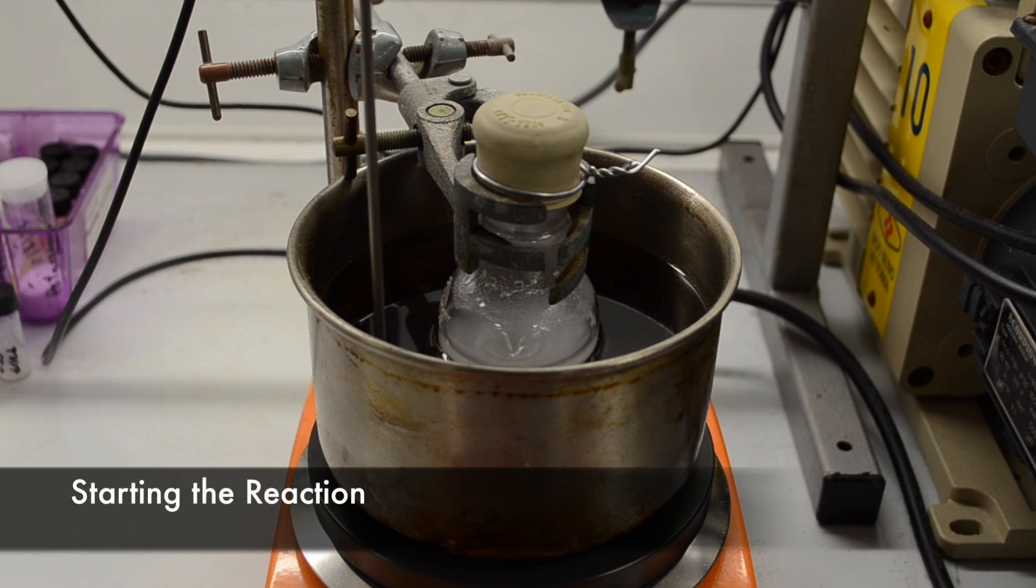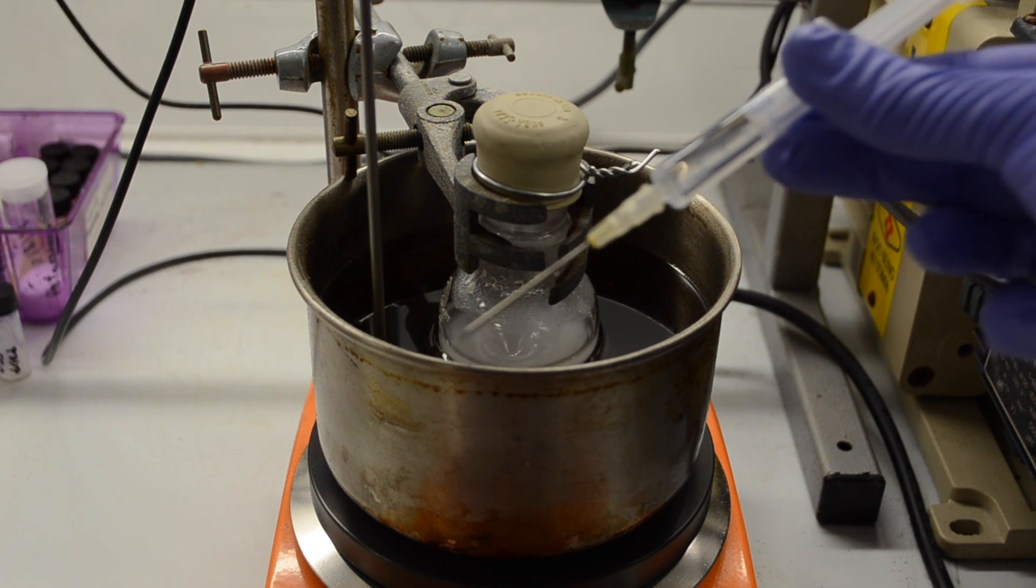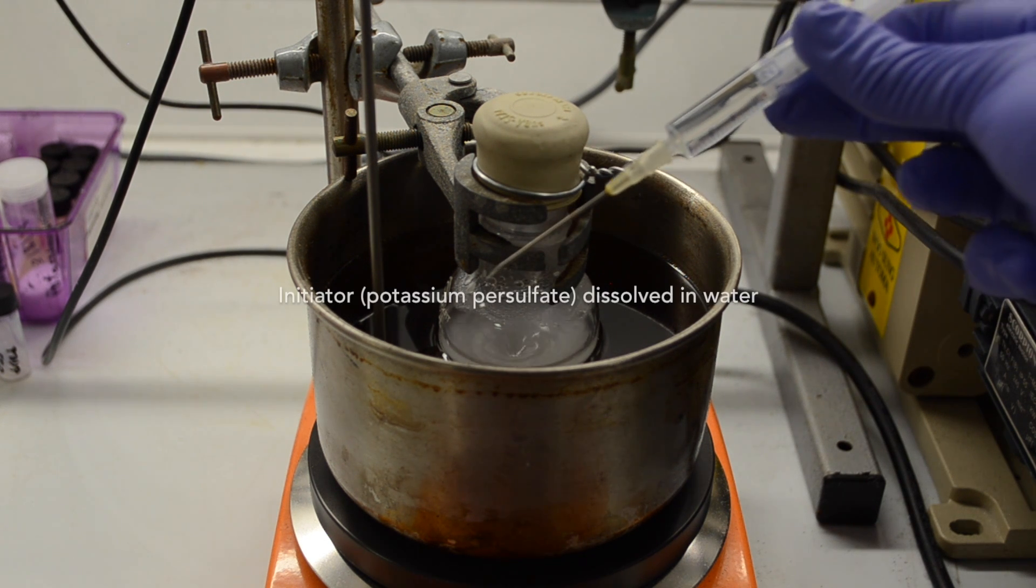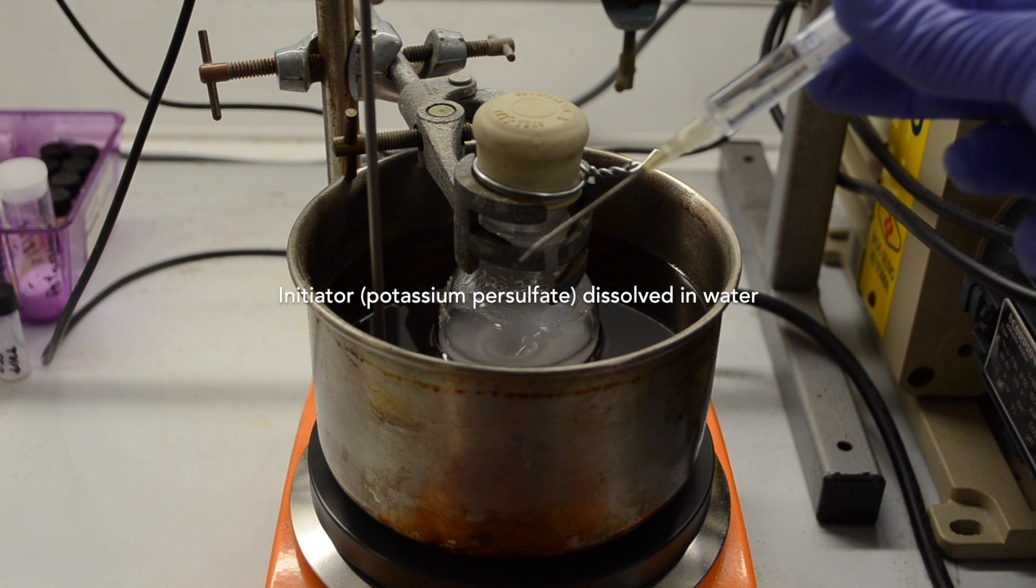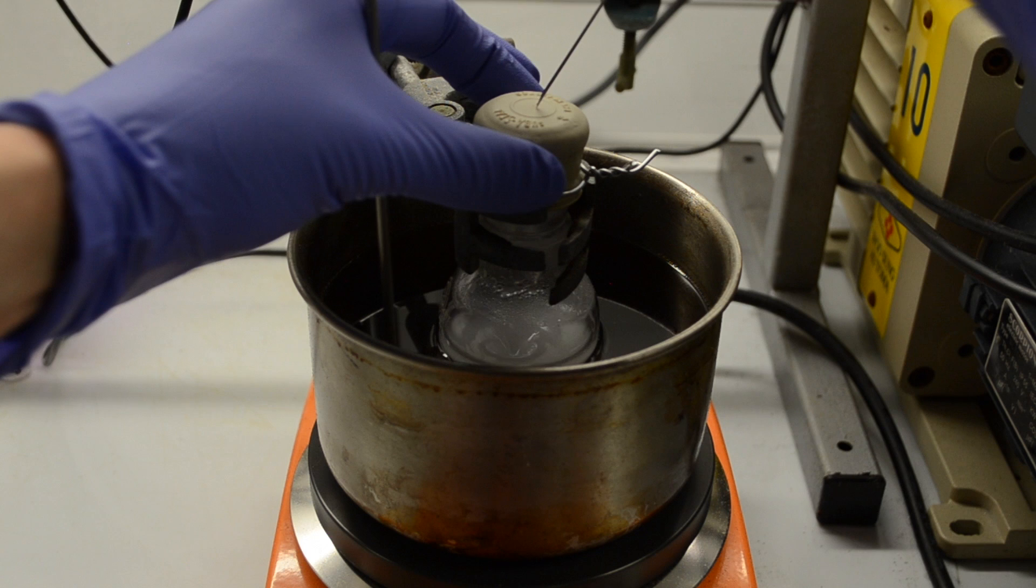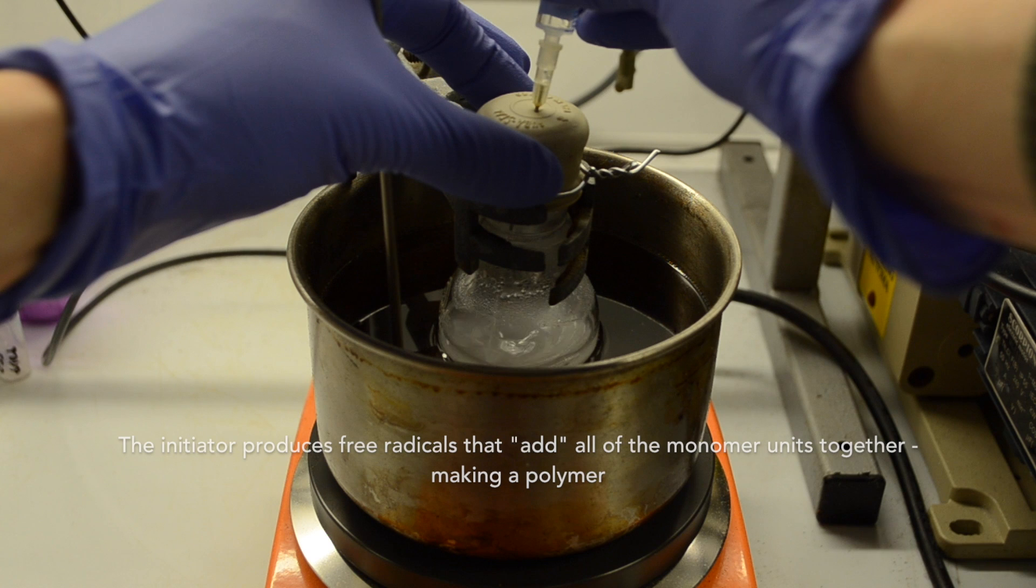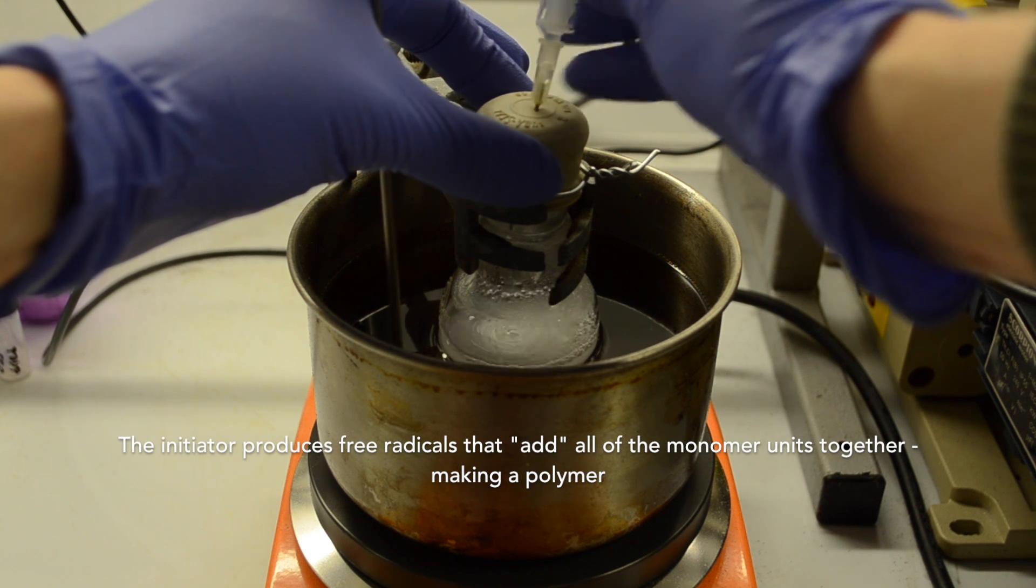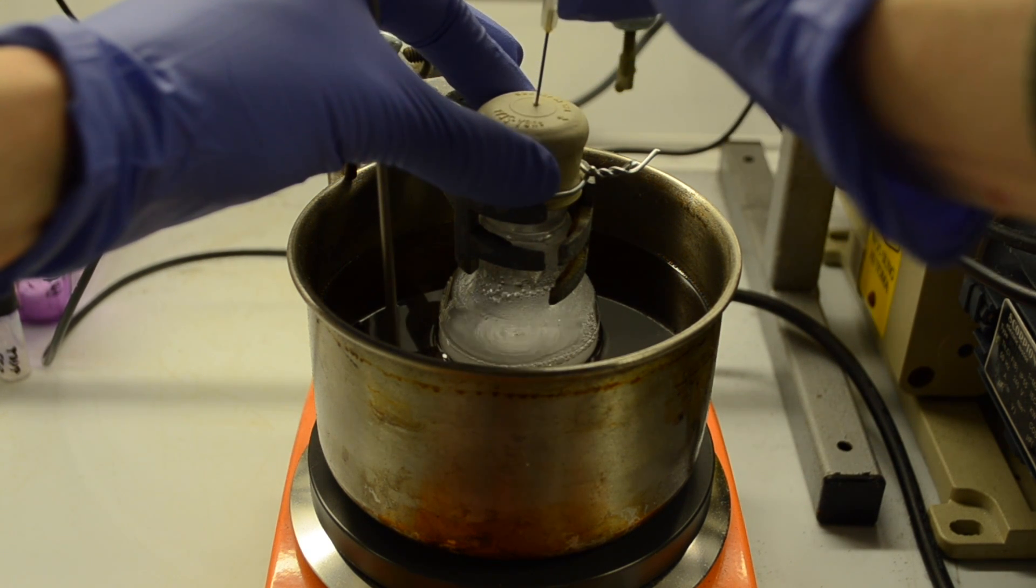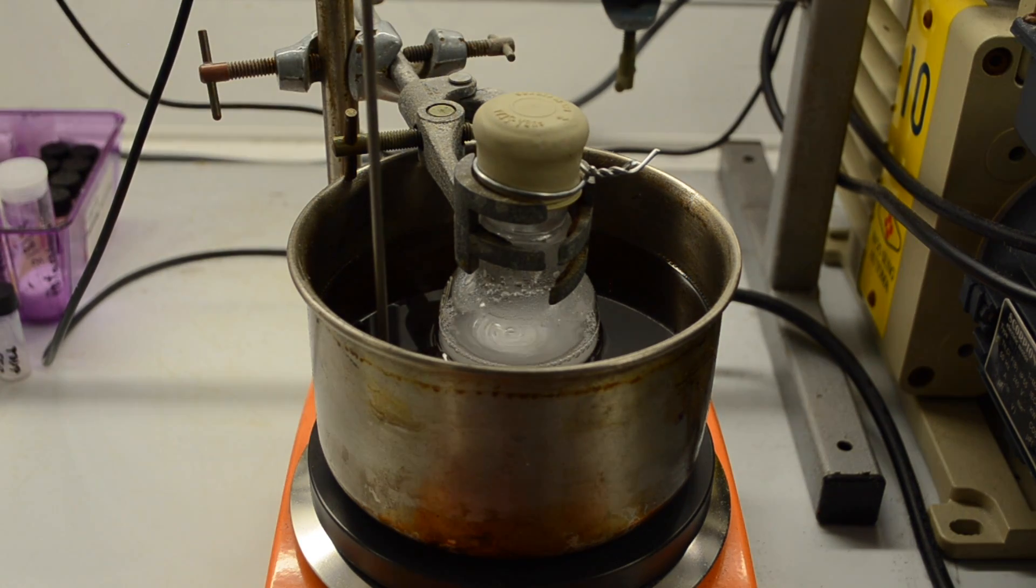So we're about to begin our reaction now. I've immersed our starting solution in our oil bath, which is set to 90 degrees to allow it to heat up. And what I'm now going to do is inject our initiator using this syringe and needle through the rubber septum at the top of the flask. So we'll just put that in there safely and inject our initiator. Our initiator is already dissolved in a bit of water. Pull that out and away we go.